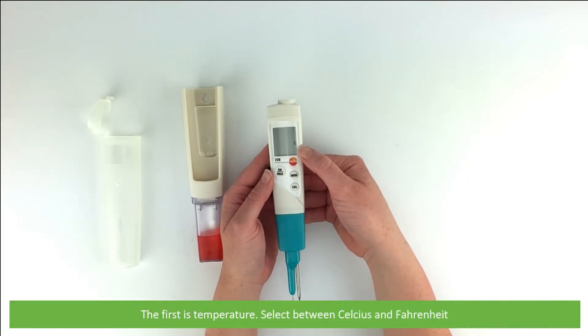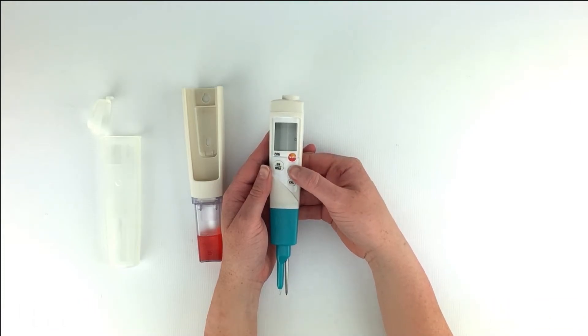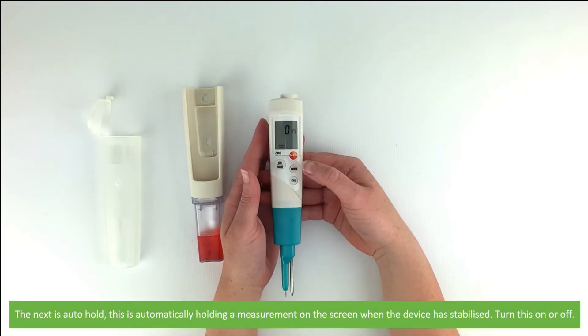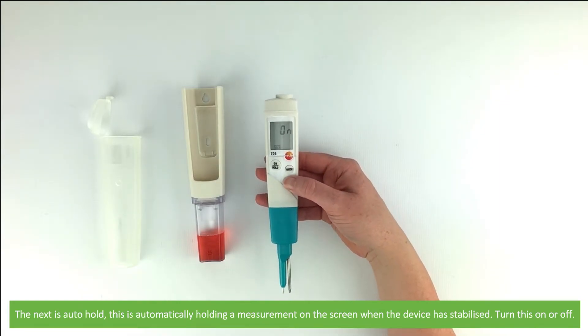The first setting is temperature — select between Celsius and Fahrenheit. The next is auto hold, which automatically holds a measurement on the screen when the device is stabilized. You can turn this on or off.